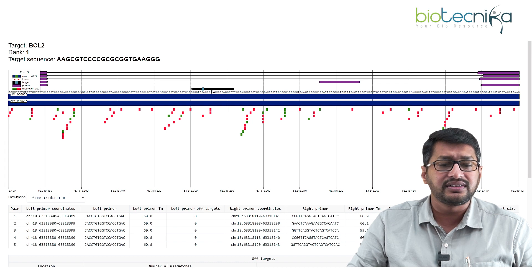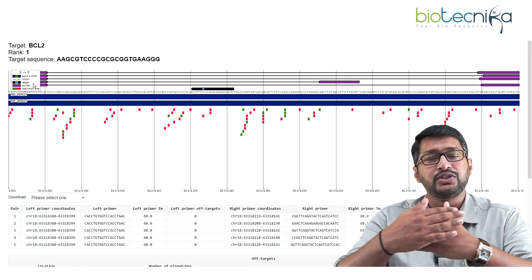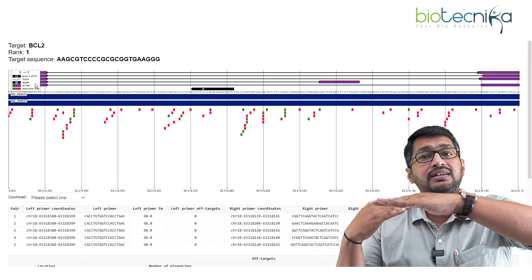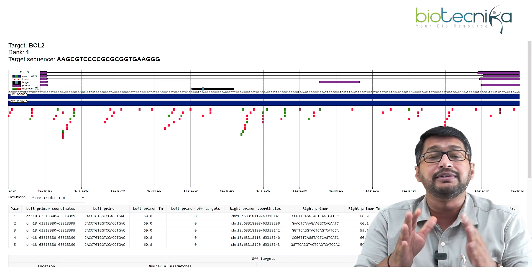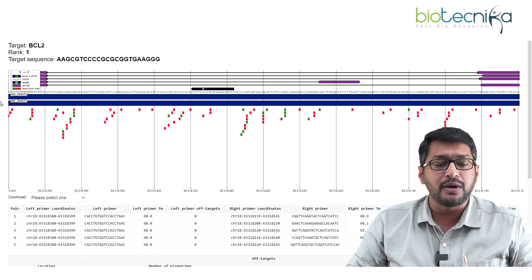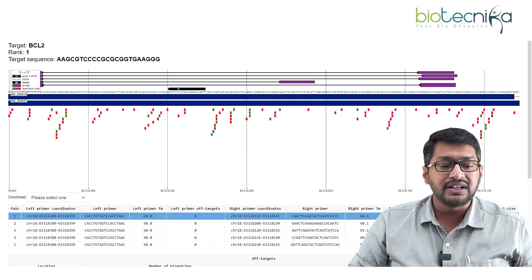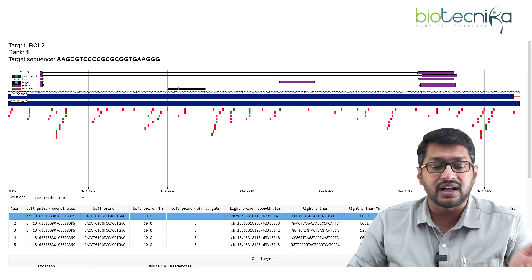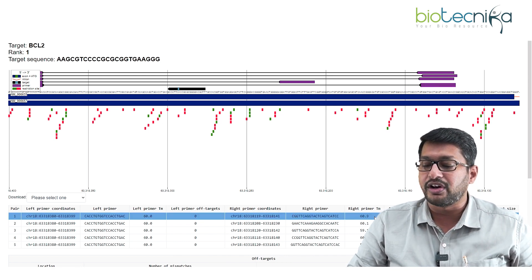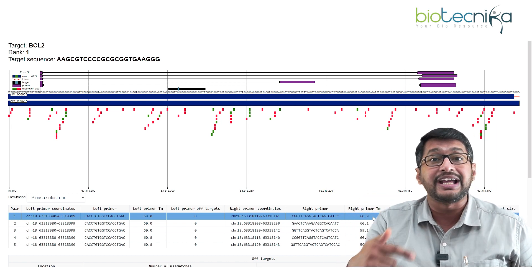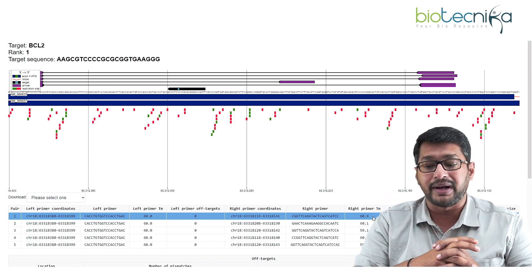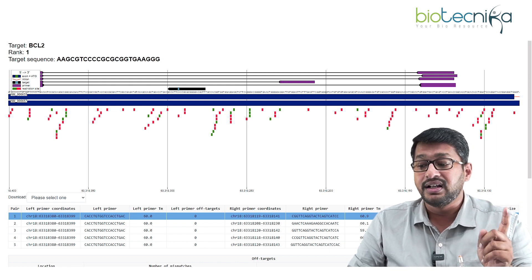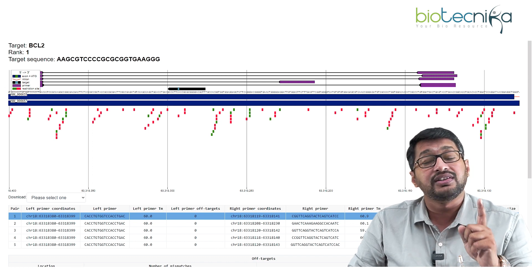The new window shows the primer that anneals to the target sequence. Below the table, you have the left primer and the right primer with their coordinates. The left primer has a Tm of 60°C and the right primer has a Tm of 60.9°C — great news, as this allows a one-step PCR to validate the target sequence. There are no off-targets and no paired targets reported.